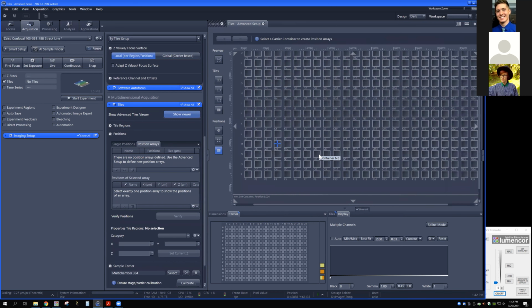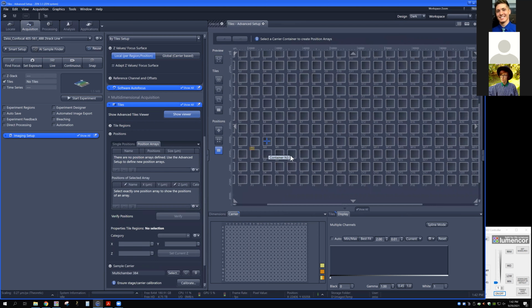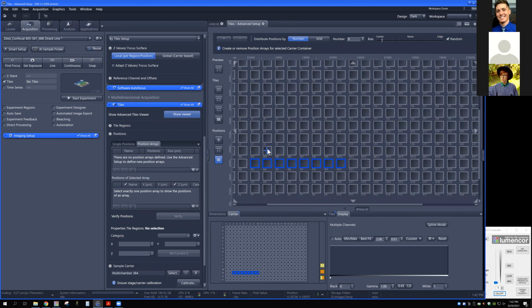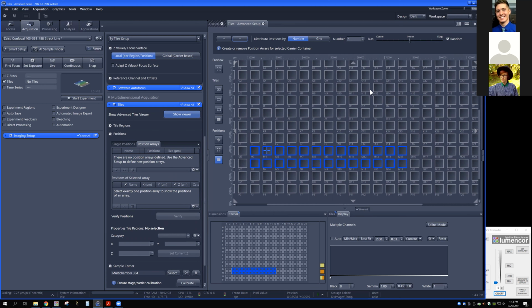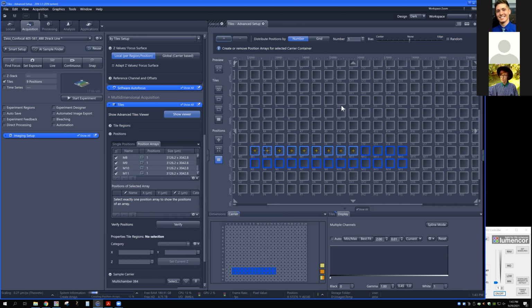All right. And so do we want to do our M3 to M10 again? Something like that? Let's do M and N. And let's take it all the way to 15. I kind of want to get more towards the center of the plate. Sure, that's fine. All right. And we just want to do a single position? Just a single position. That's good enough to determine whether or not. Yeah, of course. That's done. There we go.